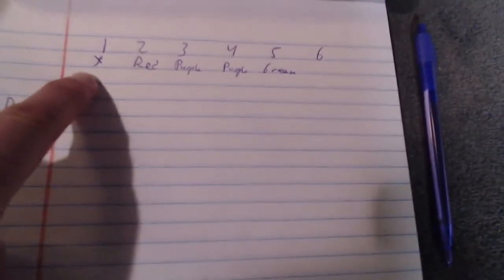Lane 1 was blank, lane 2 had the red cap sample, lanes 3 and 4 had the purple cap sample, and lane 5 was the green cap sample. These are DNA samples cut with different restriction enzymes, and we're going to see the pattern for them. Remember, restriction enzymes are enzymes that cut DNA at specific nucleotide sequences. So let's go over here and see the gel.